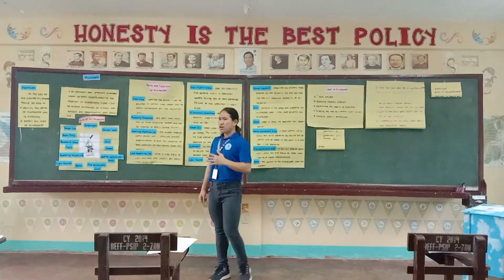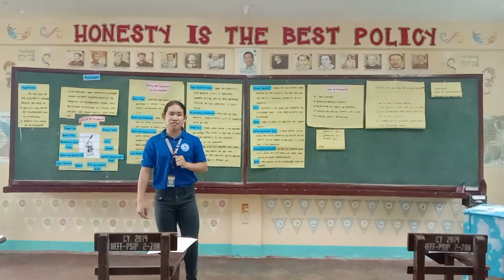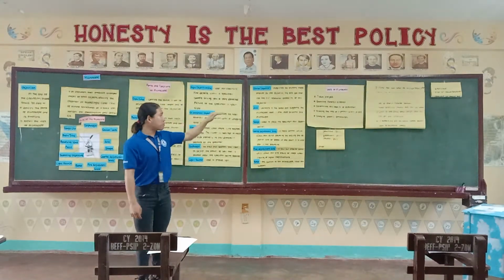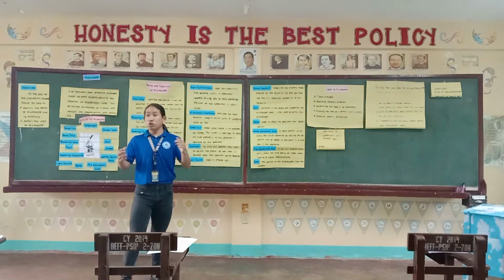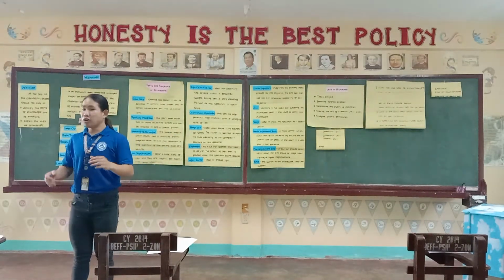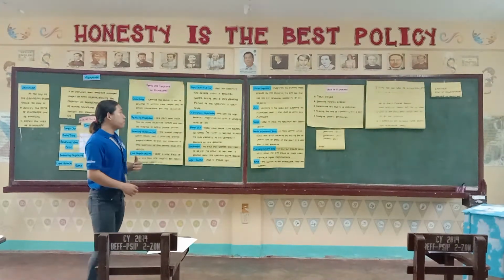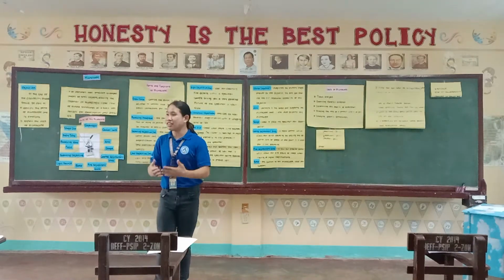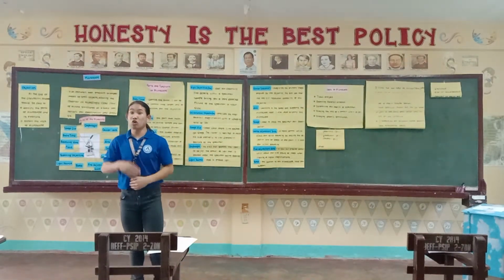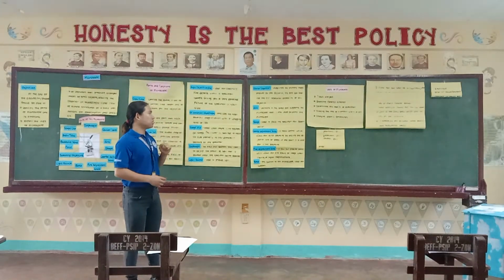Why is it that using microscope we can examine forensic evidence? Yes, we have to use microscope be able for us to examine forensic evidence because during a crime, the fingerprint or the thumb and also the bullet used in a certain crime can be examined through a microscope. We can identify the fingerprint of the person who commits the crime. So that is a microscope use.